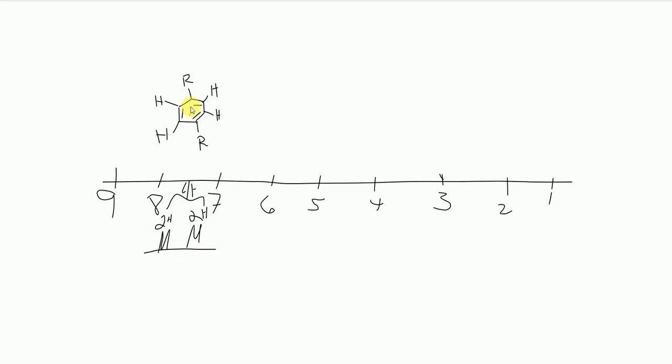All right, so this is always going to look in the 7-8 region. You're going to have the doublet peaks. Okay, now that's the only really structurally unique type of thing. All right, there's 2 more little things, but besides that, nothing really.